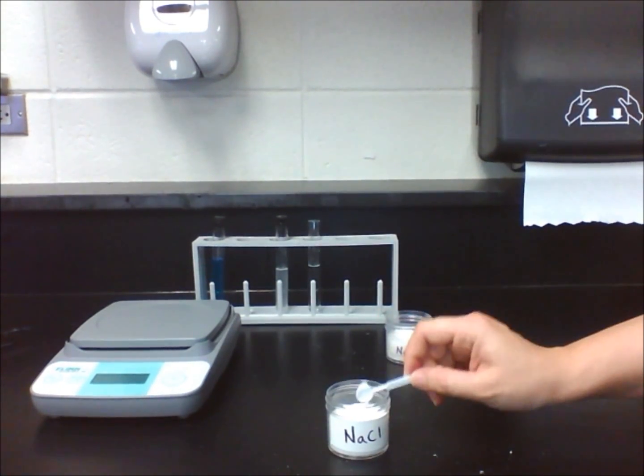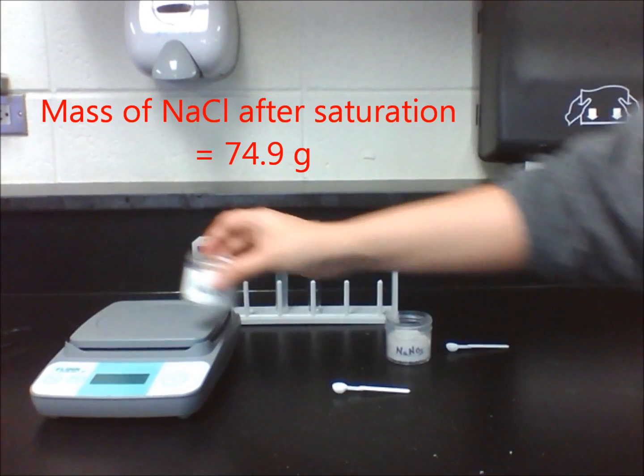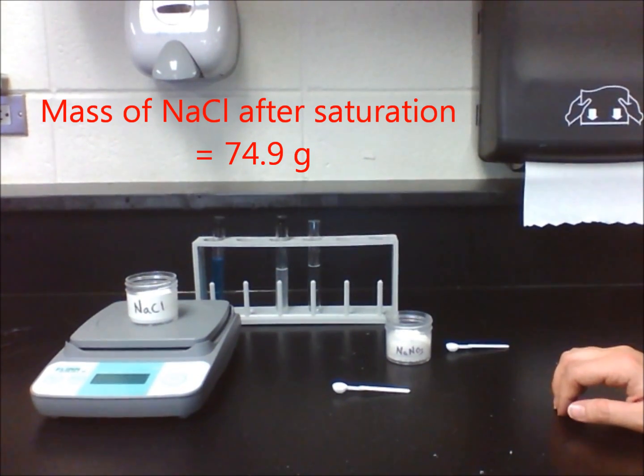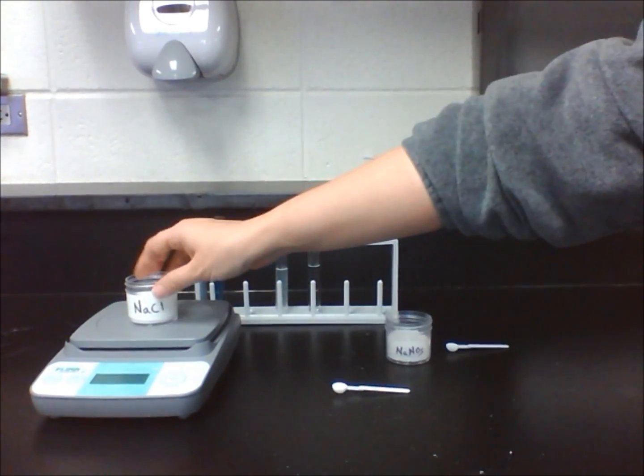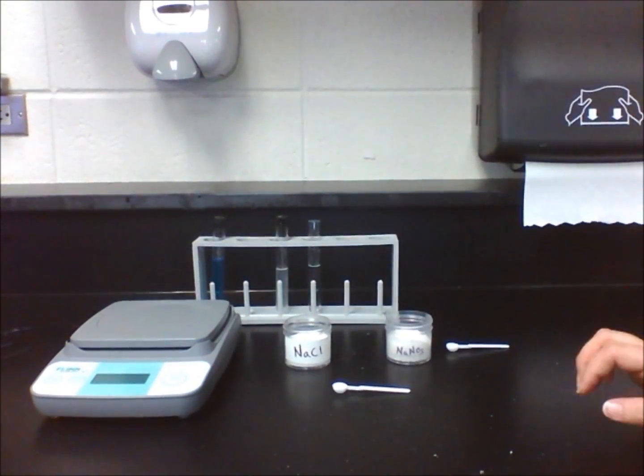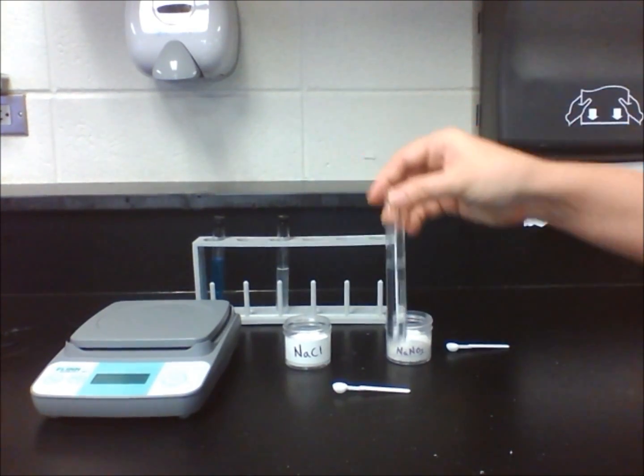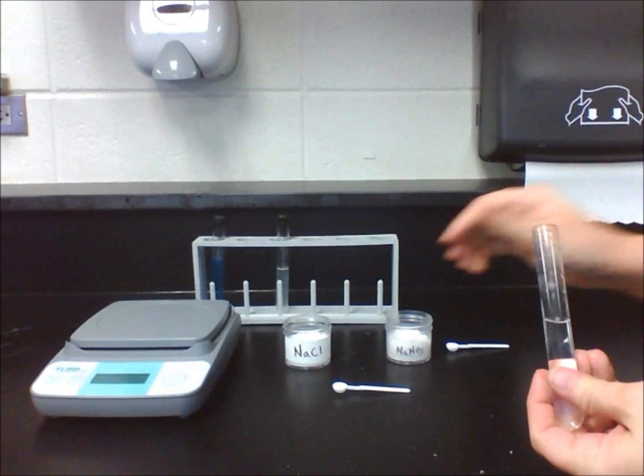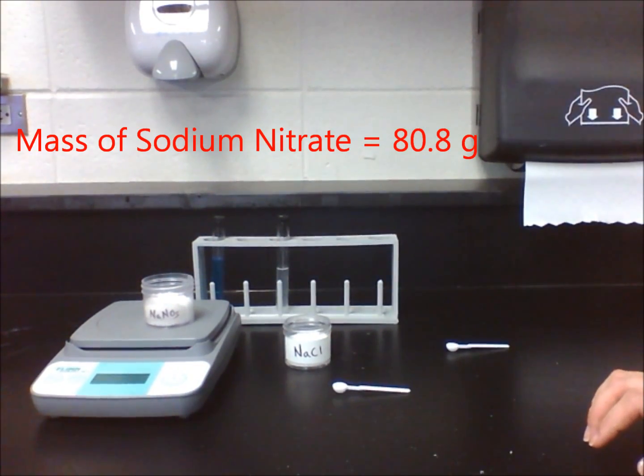Let's test the solubility of sodium nitrate. Fill a test tube with 10 mL of water. Mass the jar of sodium nitrate on a scale and record your results. Place one scoop of sodium nitrate in the test tube. Place the stopper in the test tube and shake 40 times again.